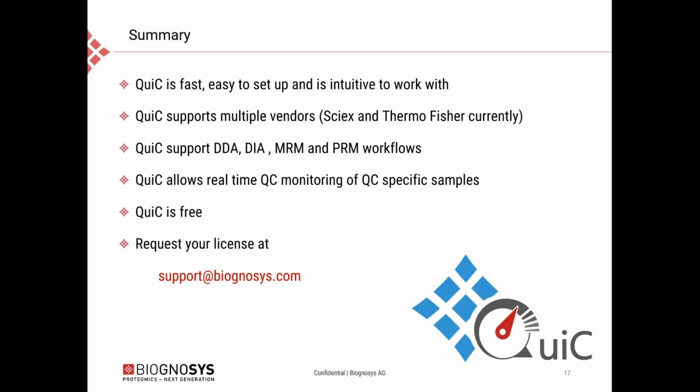Then the next question is about what the QC standard mix is. The QC standard mix is the IRT peptides, which are non-naturally occurring, chemically synthesized peptides that were first introduced for scheduled MRM and were later adopted for the analysis of DIA or SWATH data. The IRT peptides can be ordered either via our online shop or by sending an email to order@biognosys.com.